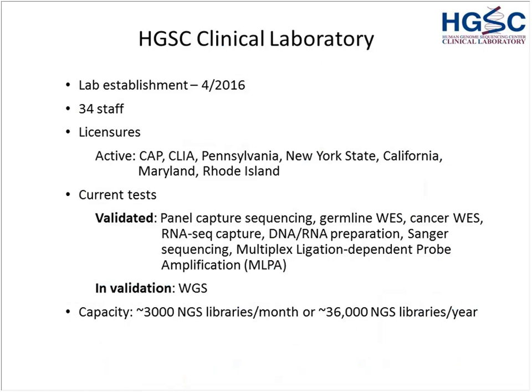The currently validated tests are for multiple DNA and RNA sequencing, sample preparation, and also variant validation with Sanger and MLPA. We have whole genome sequencing in validation now. Very soon, it will be implemented. The clinical laboratory has the capacity of about 36,000 next-gen sequencing libraries per year.